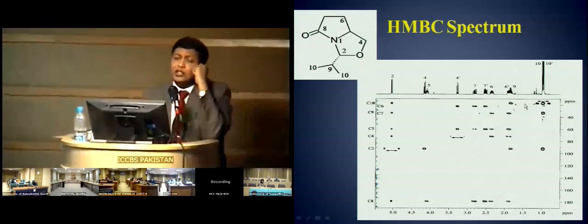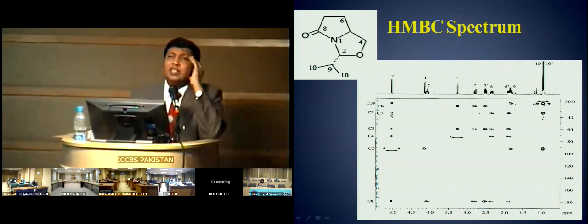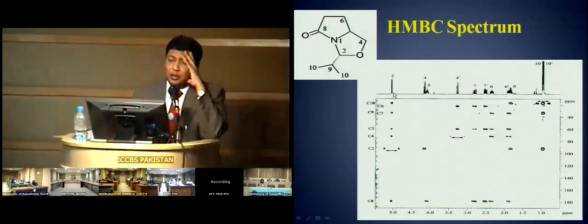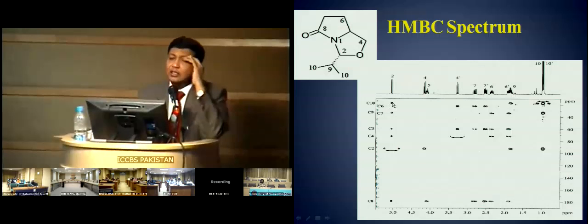The interpretation is extremely easy, but you see more peaks in HMBC, because in HMQC you were only looking for a coupling partner. In this case, you are looking for its interaction with lots of other carbons. For instance, this is C2, so you make a straight line from C2, right? This is the H2 proton. This proton is coupled with C10, okay?